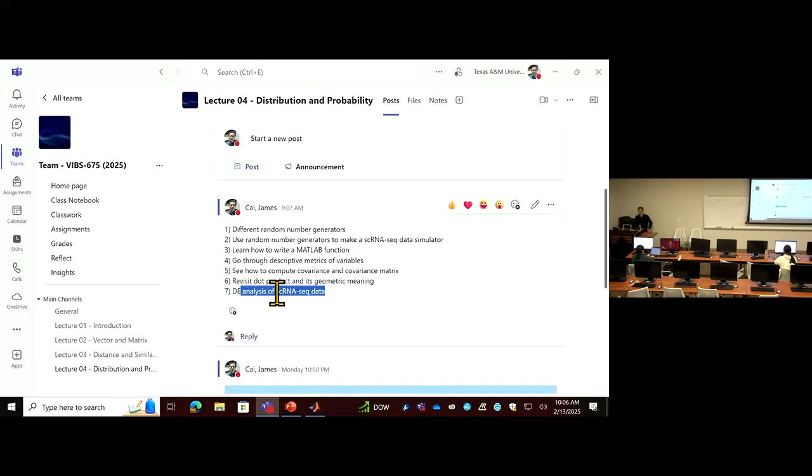And then if we still have time, we will do differential expression analysis. See how we can download two data sets and compare them. Of course, these two data sets have to be comparable. They are either from the same cellular system, so they have shared cell types. Then you compare, for example, a wild type against a knockout sample. So how can we do that?